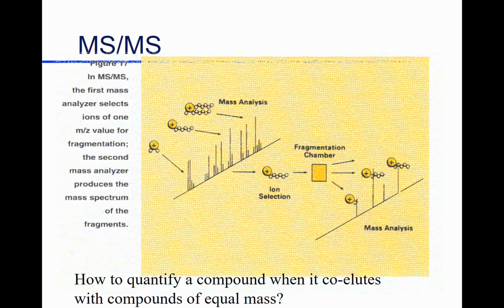And as I said, on a low resolution instrument, you can have many different compounds, molecules, that make up a specific mass. So you may well be interested, 2 compounds may have very similar spectra, so you start selecting, okay, I'm interested in this particular ion fragment. What is that? It's 136 mass. There are about 9,000 compounds that have that mass.